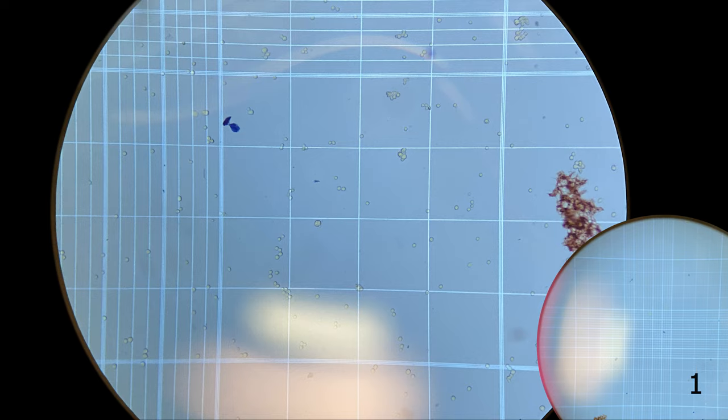I counted the number of cells in this P-square and I determined there were 97 live cells. These are those clear cells and there are no dead cells. I see no cells that are stained blue. I do see some blue artifacts in there, but I do not believe they are cells, so I will not count them. So I would record 97 live cells, zero dead cells, and 97 total cells. That's the sum of the live and the dead cells.